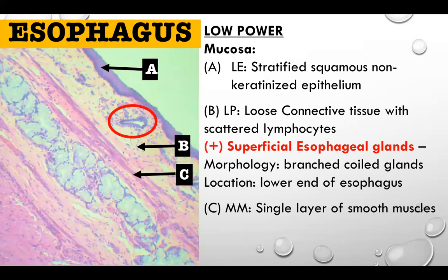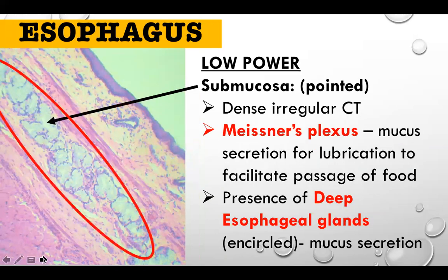The clue for the submucosa is the deep esophageal glands. The submucosa is composed of dense irregular connective tissue. Also present, though not visible in this slide, is the Meissner's plexus — nerve plexuses responsible for mucosecretion, which lubricates and facilitates the passage of food from the oral cavity down to the stomach.